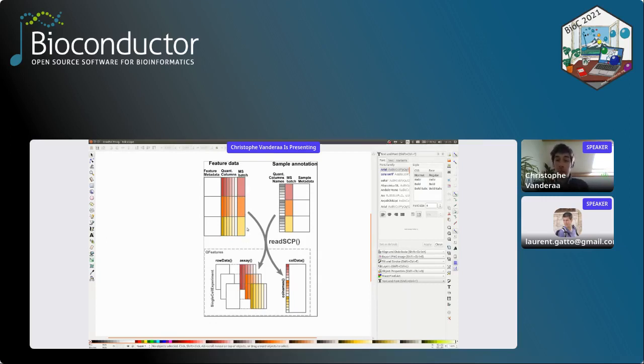That's for the feature data, the quantitative data and metadata. Then you also have the sample annotations, because it's nice to have samples, but in downstream analysis we want to do more than simply having quantitative data. We may want to do differential expression, so having conditions, or keep track of batches during processing that might influence the quantitation. So in the sample annotation, we have two required columns. The first one is the MS batch, exactly the same as here, so each sample belongs to a batch. The other one tells us in which column we find that sample.